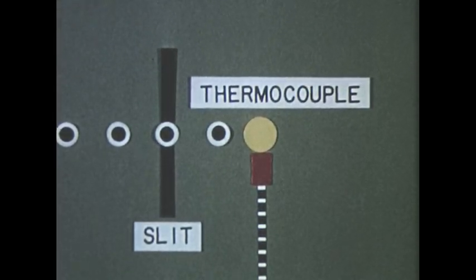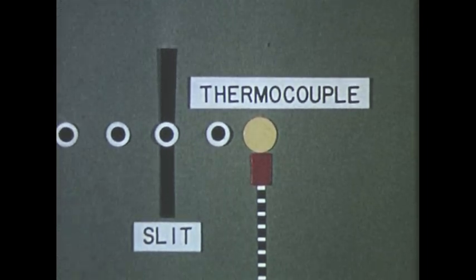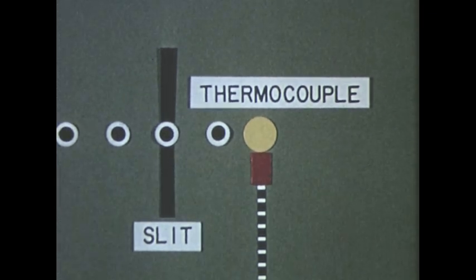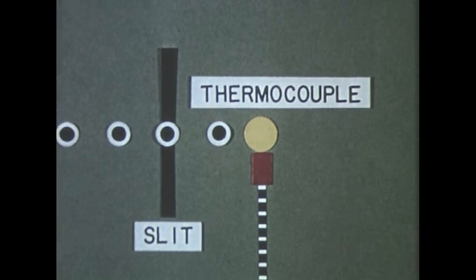The thermocouple reacts to differences between reference and sample beam only. Therefore, if the intensity of the two beams is equal, no significant change will occur in the recorded image. Thus, atmospheric water and carbon dioxide bands are canceled out by the double beam system.